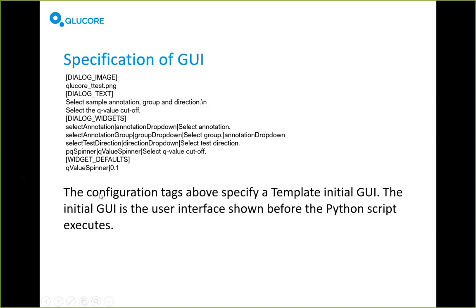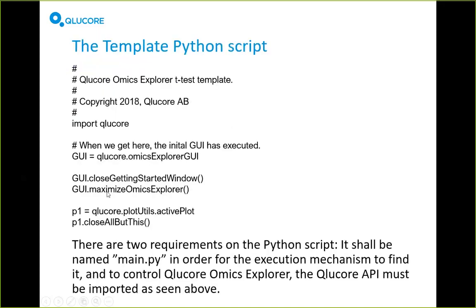The Python script has a couple of important things. First, the Cluecore API must be imported. If you use the standard installation of Cluecore Omics Explorer, this is all you have to do. If you use your own version, you'll have to put the API file within your installation — there are instructions in the manual. A simple template is rather self-explanatory and readable. Looking at the template's source code, we can see what it does step by step.